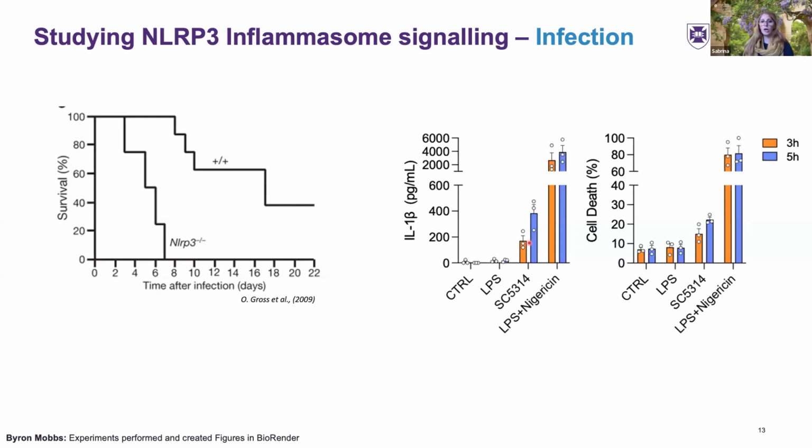So we really wanted to look at that in a more physiological way and see if we actually observe a switch in the morphology of Candida once we infect macrophages. And that's exactly what I will show you. So what we have is again Cytox in green to show whether it induces cell death. And in blue, we have a dye called calcofluor white that only stains hyphal formation of Candida once it escapes a macrophage. And that's how it looks.